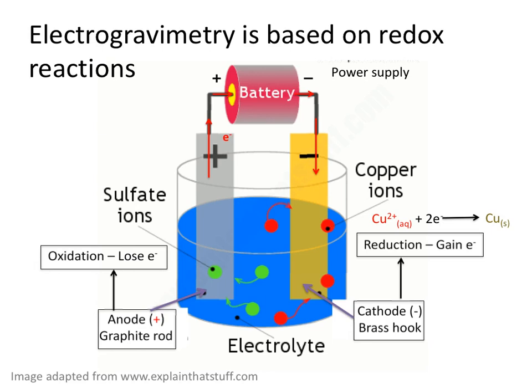The anode, which is a positively charged electrode, is made of carbon graphite. Once a current is supplied by the battery pack, electrons in solution move to the anode, through the wire, and to the cathode, which in our case is the brass hook. As a consequence of the movement of electrons, the graphite is oxidized, causing it to fall apart over time. This will be noticeable by shards of graphite at the bottom of the beaker.